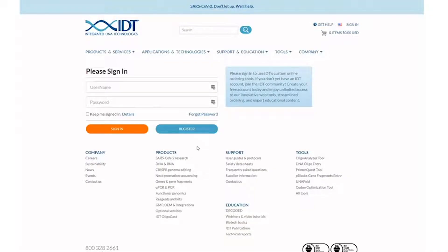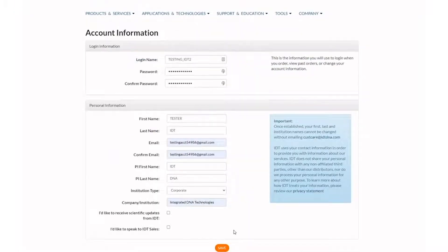Welcome! To make the most of the RAMP-C CRISPR analysis tool, we will show you how to create and manage an account. Start by setting up an IDT account. You will use this as your login to the tool.